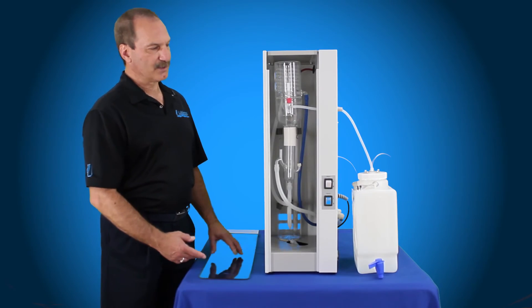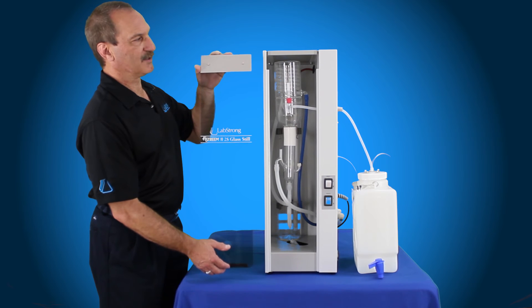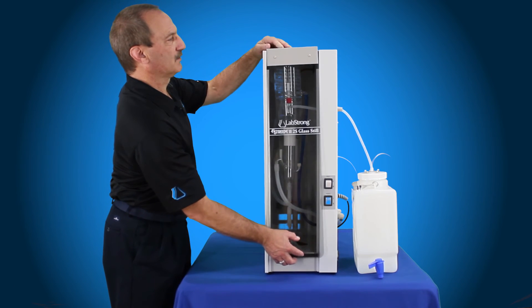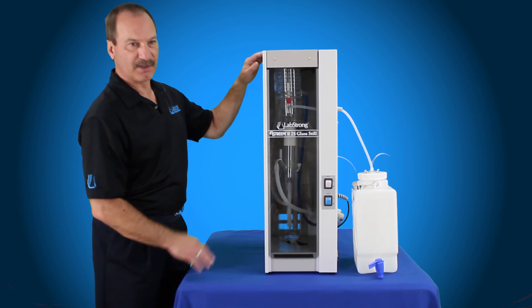Now that you have the still operational, you need to put the door back in place. This is very important — you always want to make sure the door is in place when the system is in operation; that's a safety feature. Slip the door into the two slots up above, magnetic clip at the bottom — door's in place.